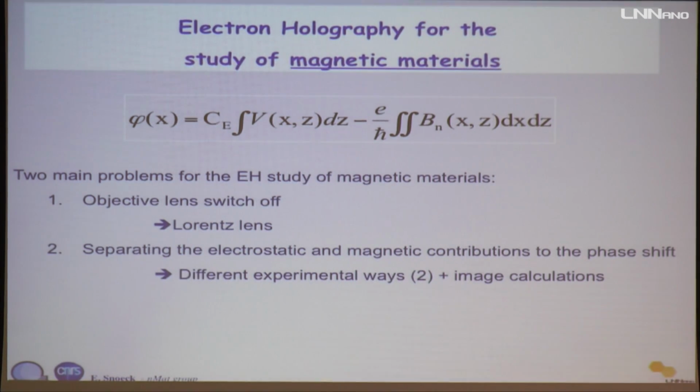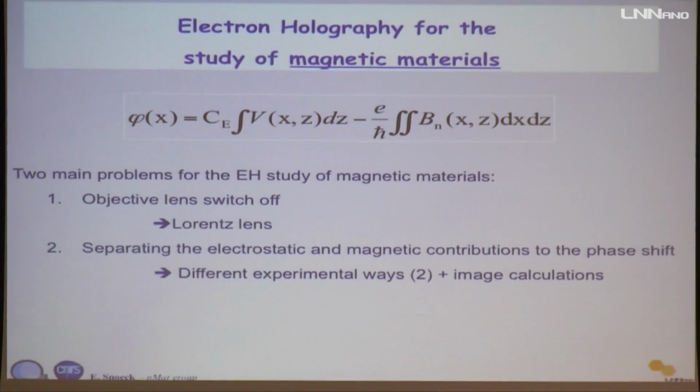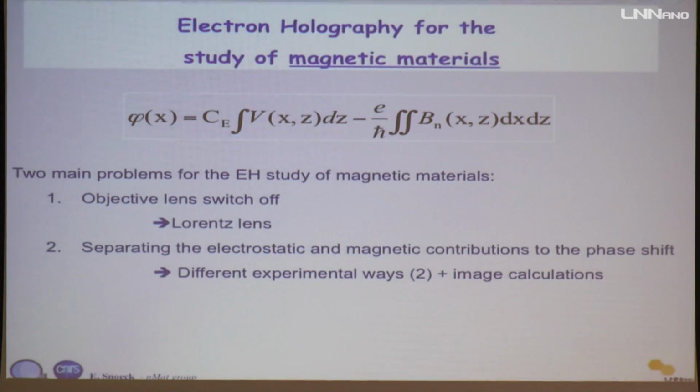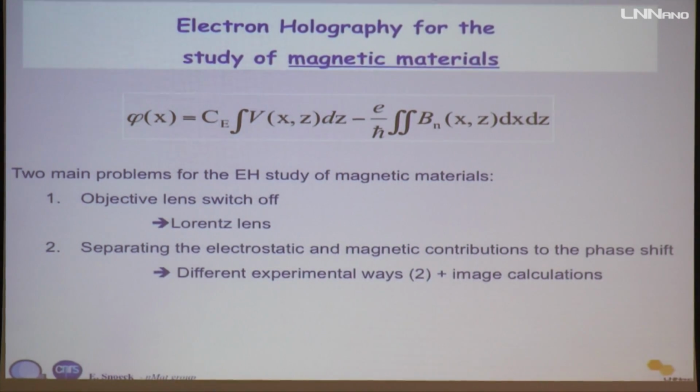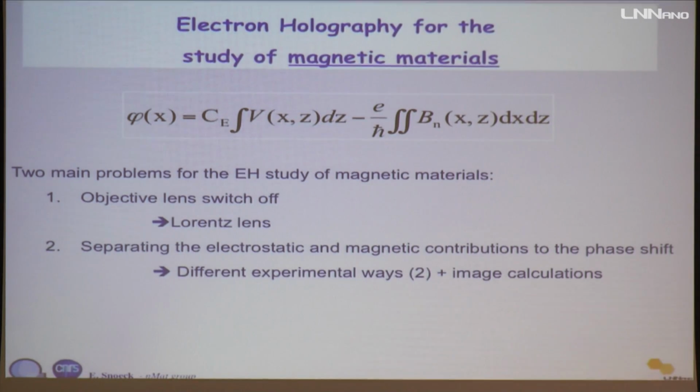So imagine you are arriving with some kind of magnetic materials, tiny magnetic nanocubes, in the pole piece of the objective lens, and then you are putting 2 Tesla on them. If you have a magnetic material, the magnetization of the material will align with the magnetic field of the objective lens. First, you will modify the configuration of the magnetic materials you wanted to study.